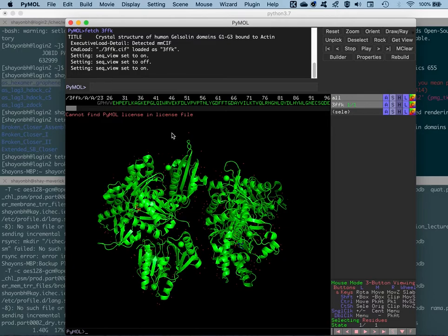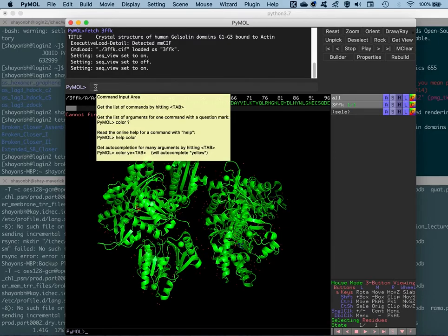Okay, let's cut to the chase, otherwise we keep digressing into the amazing other capabilities of PyMOL. So, the Ramachandran plot. In order to generate the plot, we'll have to use the command line interface again. If you remember from a previous tutorial, we changed a residue name of the ligand and changed its chain ID by using the alter command.